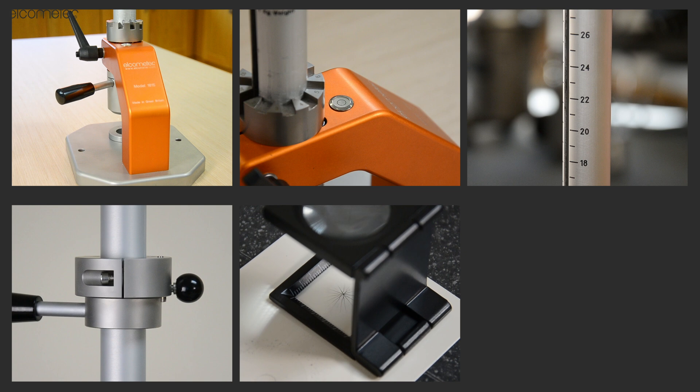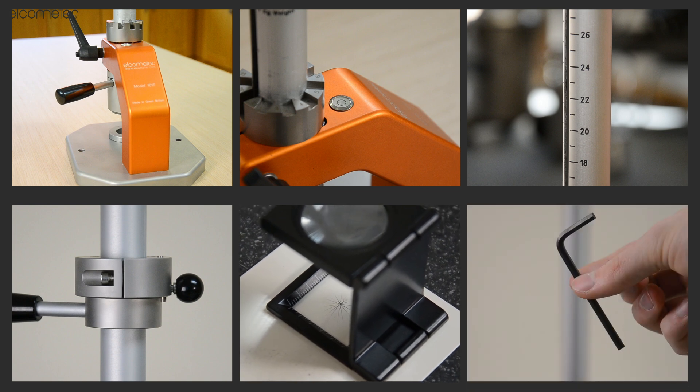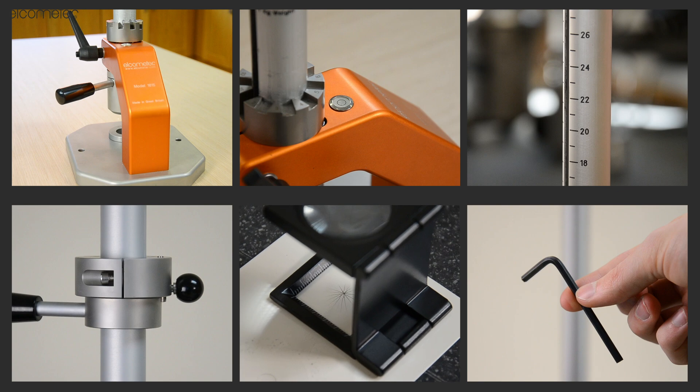It also includes a magnifier to inspect results and a 4mm hexagonal wrench key to assemble the tester.